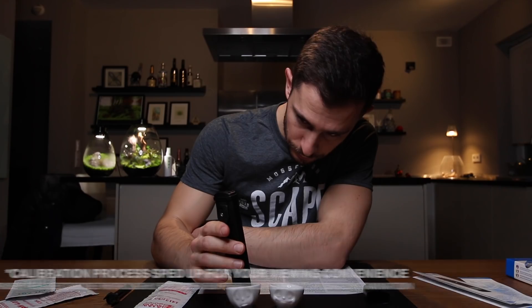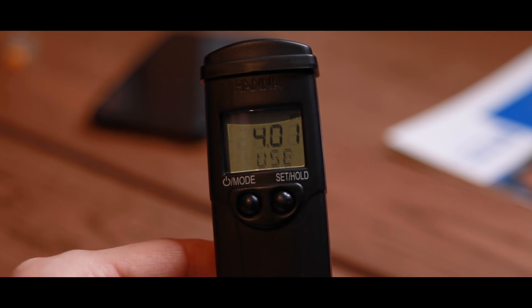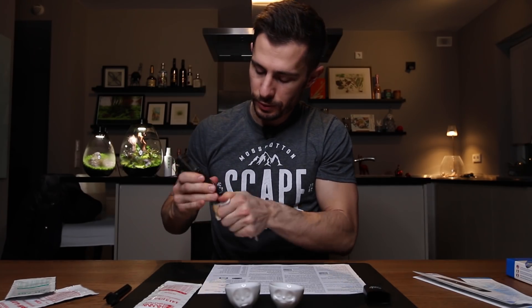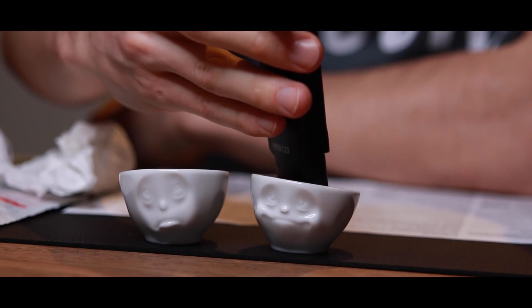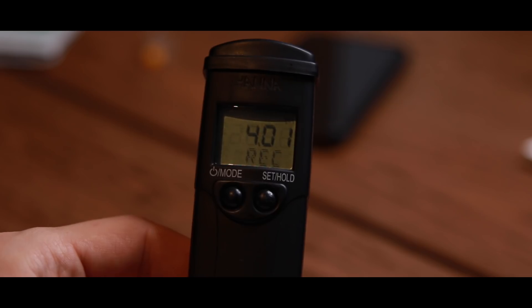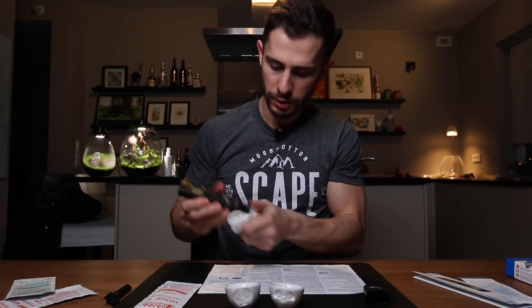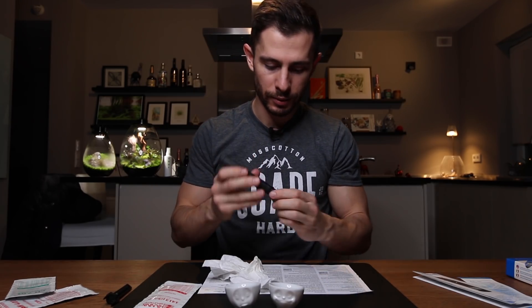At some point the device wants to see the 4.01 solution — and now it's telling me to use 4.01. So I take it out, blow it off, and now we add it into the 4.01 solution and wait until it's done. I've just seen the OK on the screen — now the pH electrode is calibrated. I like to clean it and then put it back inside.